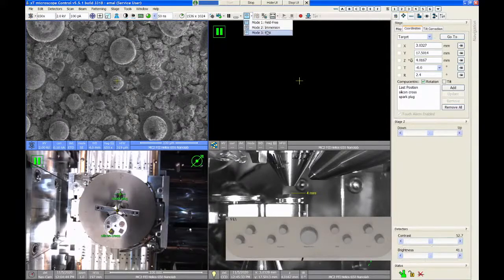So we're going to get into this in a second, but there's a low resolution and a high resolution lens. Anytime you're working on imaging small nano features, you're going to want to be using the high resolution lens. That's really where this tool shines and outperforms all the other SEMs in the lab, is that high resolution lens mode. The low resolution lens mode is pretty similar to the other SEMs. So the Tescan Mira is a big example. Image is about the same.